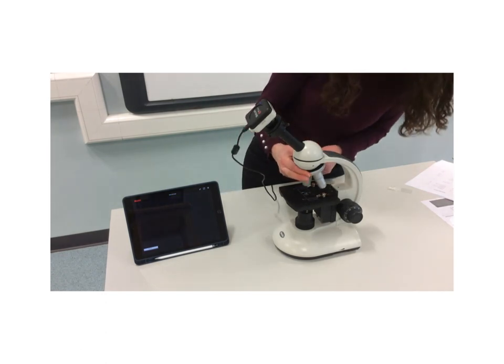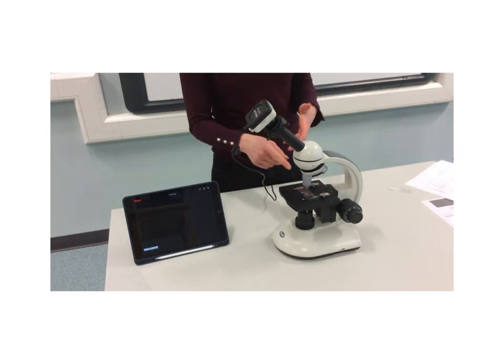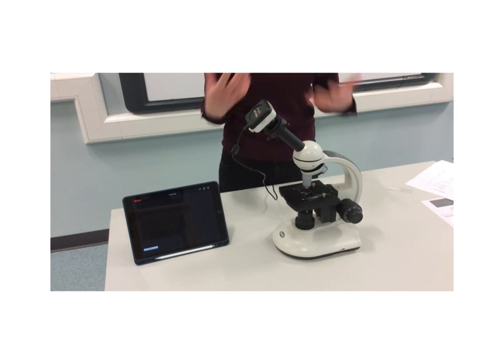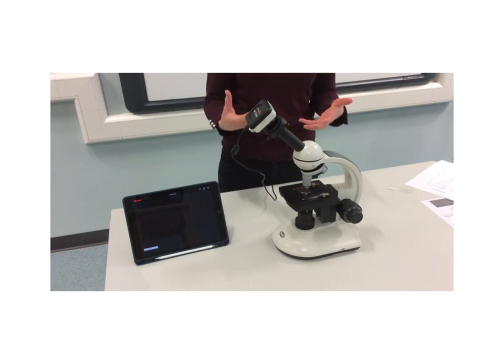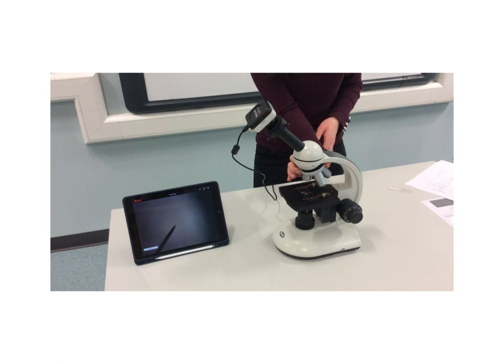And then finally, if I use the turret again to turn it to the high power lens, that is times by 40. So that's times by 40, eyepiece lens is times by 10. That gives us a total magnification of times by 400. Okay, so when we're viewing an image, we always start with the low power lens first of all.